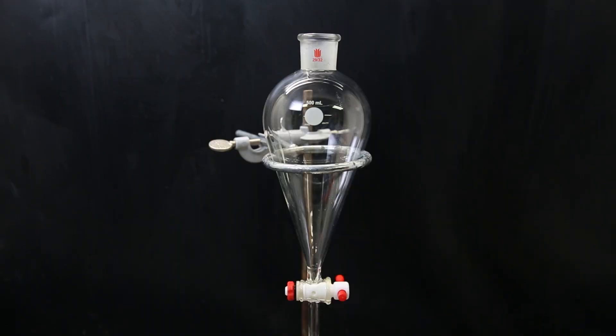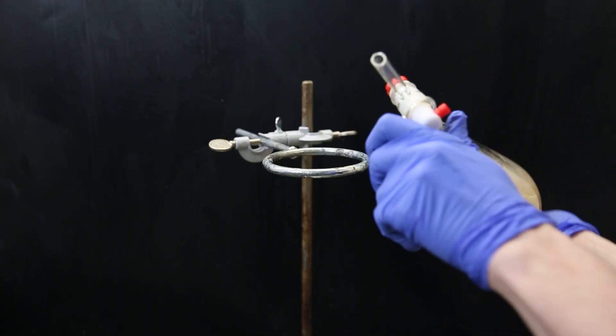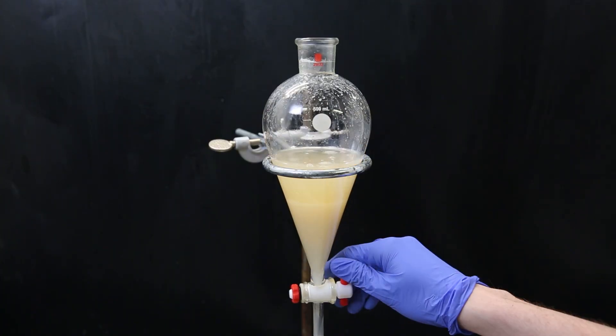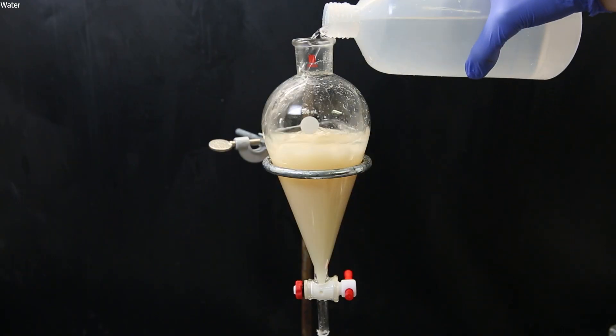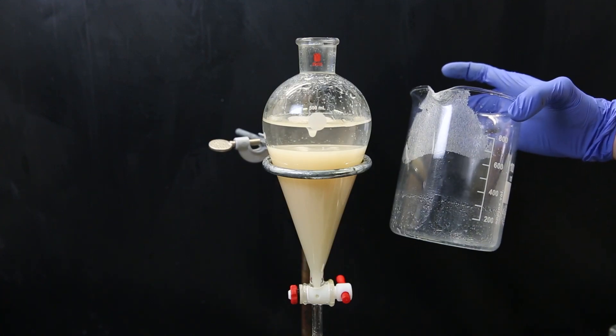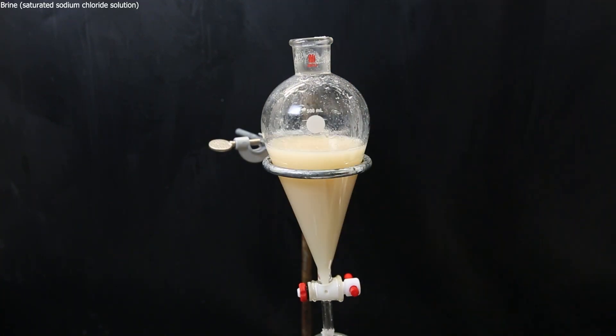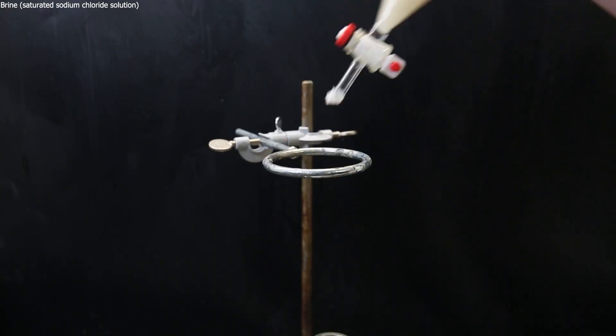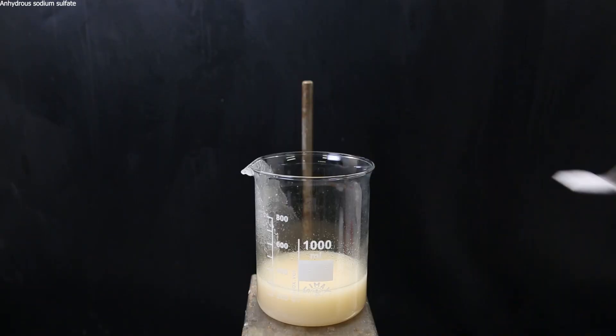And then set up a separatory funnel and pour in all of the filtrate water mixture and mix them around. And we see the dark color disappear. I return the organic layer and wash it once with more water. We can already see the product crystallizing in the beaker from some evaporating residual solvent. I separate the layers again and then wash the organic phase once with some brine, which will take out most of the remaining water. I then take the organic phase and add some anhydrous sodium sulfate to it to absorb any droplets of water.